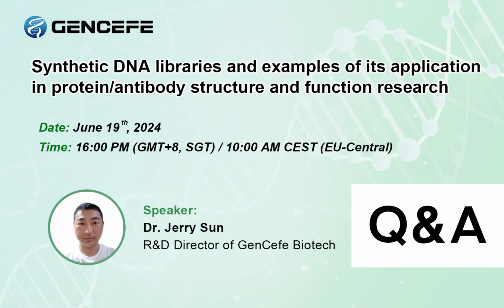Hi, this is Azhar from India. So I have one question. Do you provide this synthetic library as gene fragments, or do you provide it in a vector? Both are okay. We can provide the gene fragment, and we can also provide them cloned in vector.